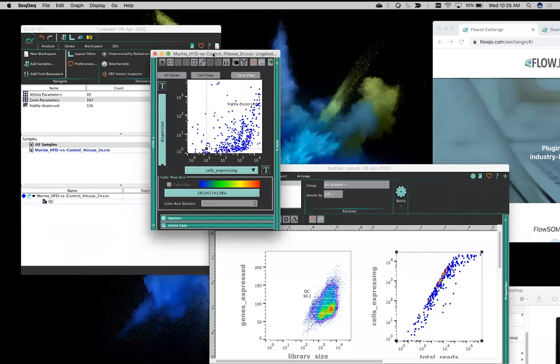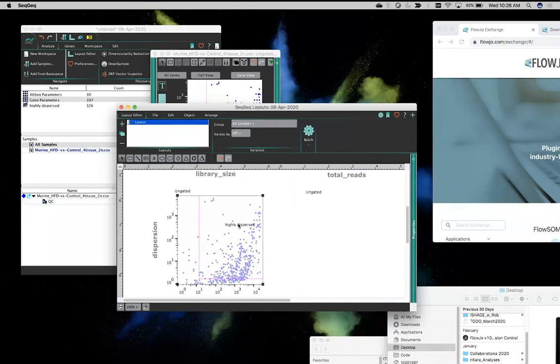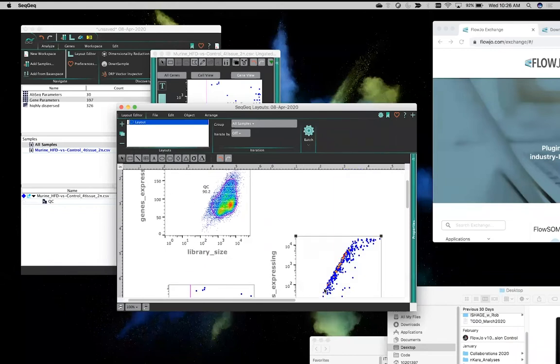So yeah, 397 is just the targeted immune cell panel, which is going to give you a really high resolution view of those particular 400 genes, because we are allowing the sequencer to give more reads to each of those genes. And so we think we get a higher resolution picture of those parameters. But if you've got whole transcriptome, if you're doing kind of blue ocean discovery, you can absolutely load your 30,000 gene set sample into SeqGeq and start your analysis there. You can even, if you're particularly focused on a certain subset, sometimes it's nice to do some whole transcriptome data analysis to figure out what panel of targeted sequences you might want to look at going forward.